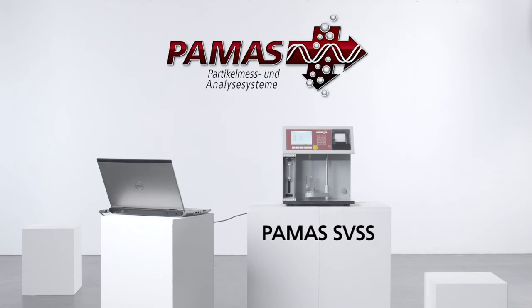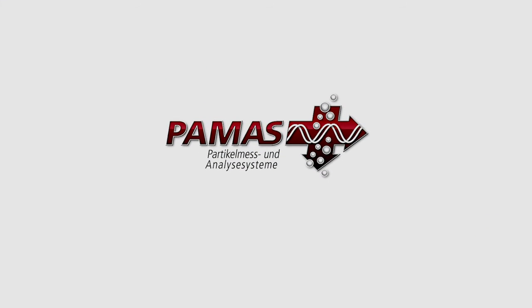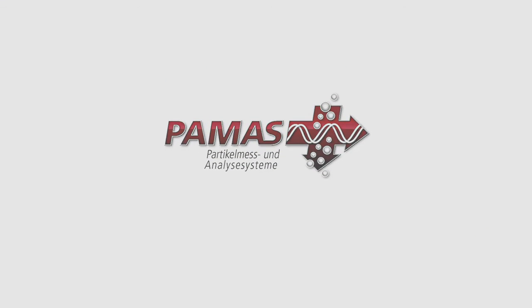The PAMAS SVSS, the versatile particle counter designed specifically for pharmaceutical applications.